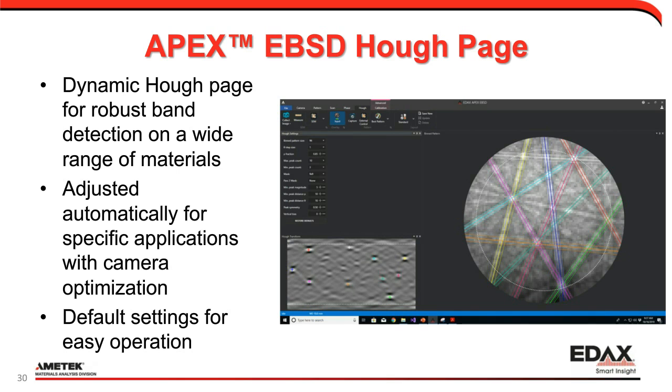And then, of course, we also know that this can be a little overwhelming at times. So there are easy default settings for basic operation as well. For your most common materials, the defaults often work pretty well, but it's expandable as you go beyond that.